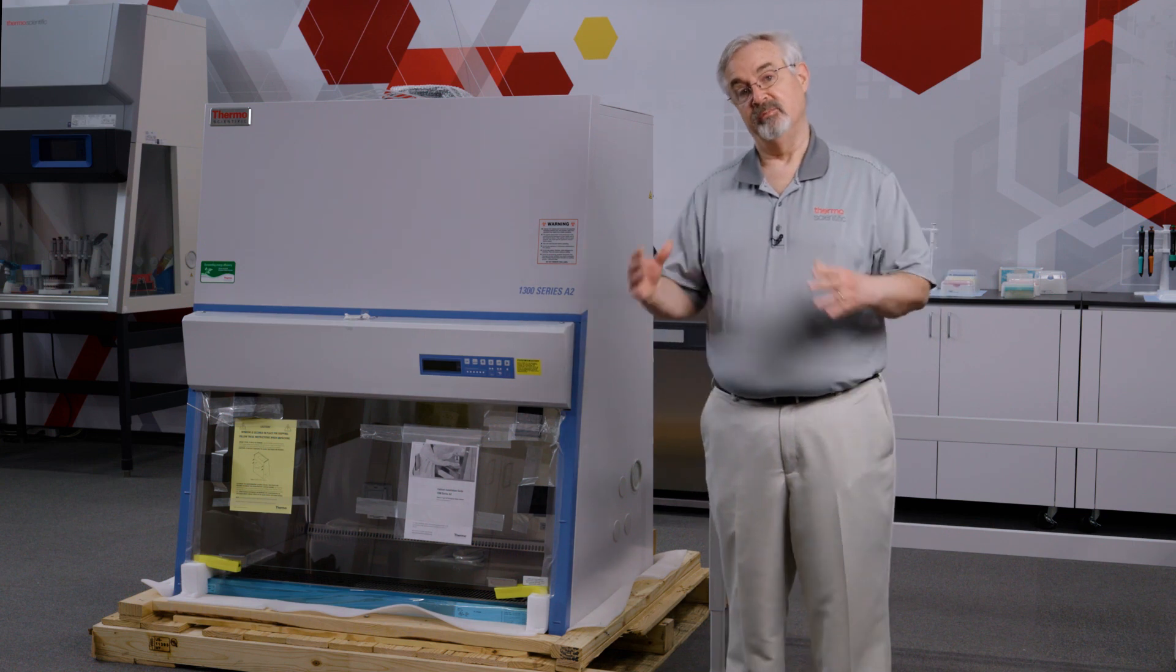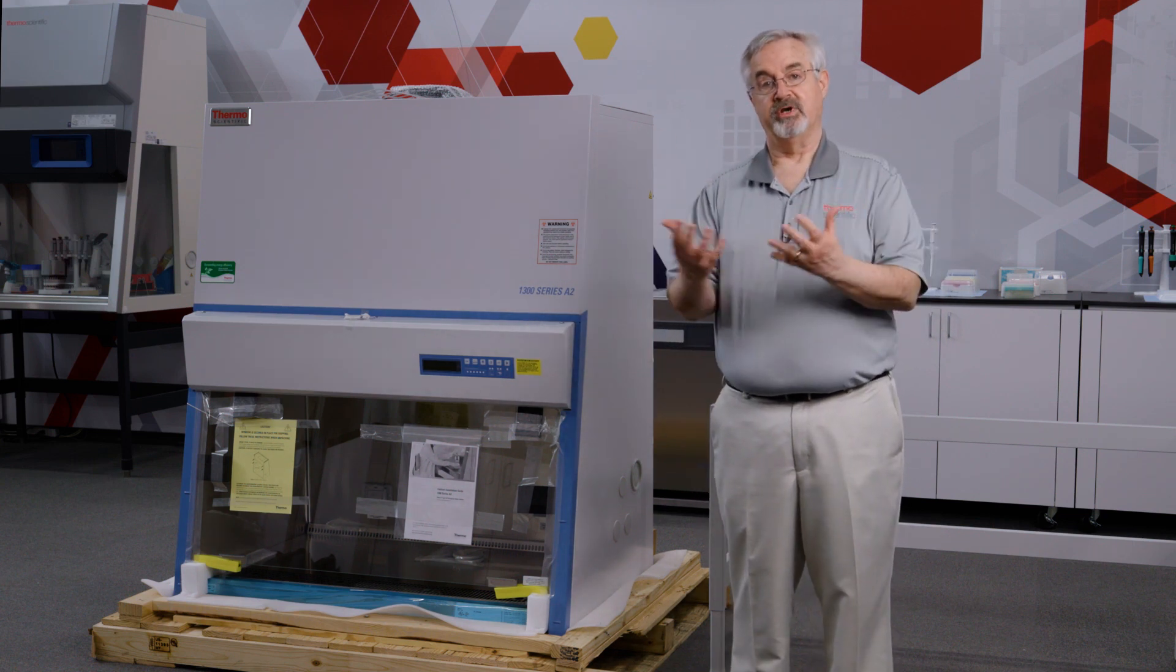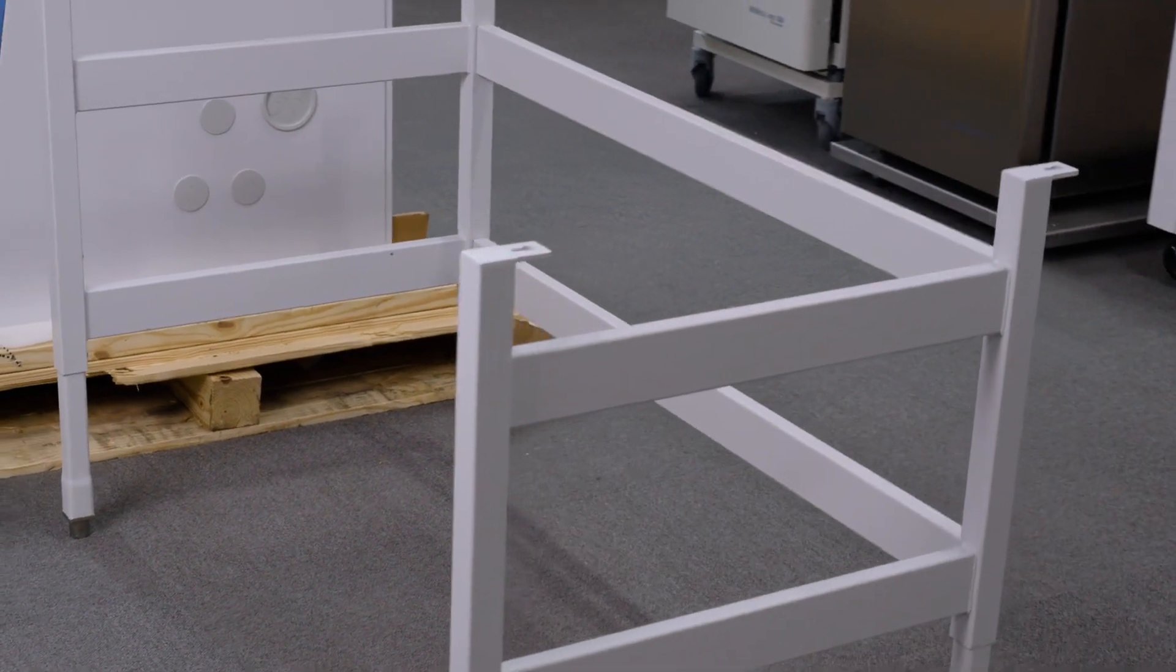When the cabinet arrives, it will be on a pallet with a cardboard case. Today, in the interest of time, we've removed that cardboard case, and we've also taken the stand off and assembled it. The stand was disassembled and packed and placed here against the back of the cabinet.